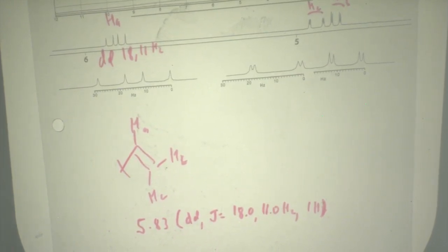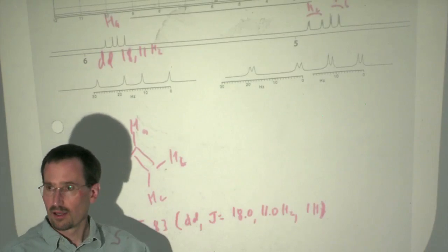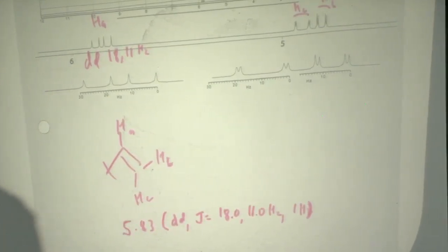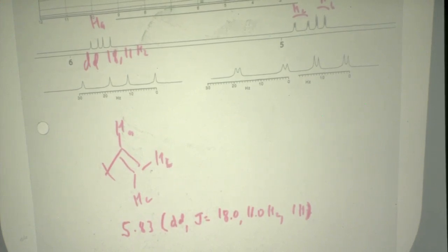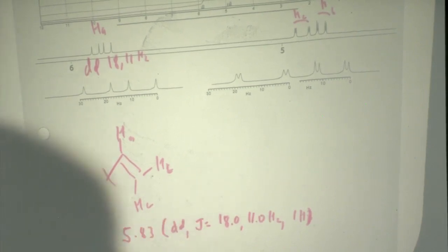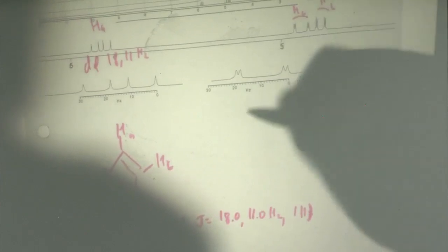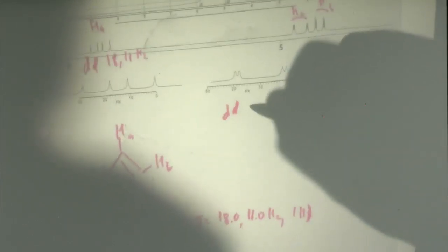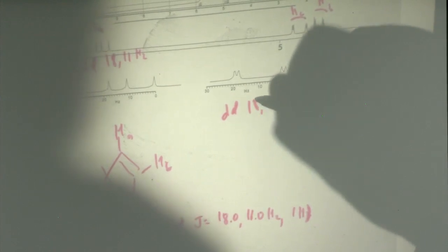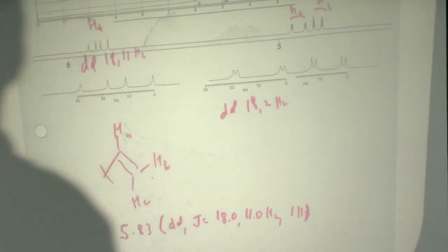All right, what about HC? 17 and 2. What did you get? 18 and 2. So about 18 and 2. It doesn't surprise me that the two coupling constants are the same, because coupling constants should be the same.